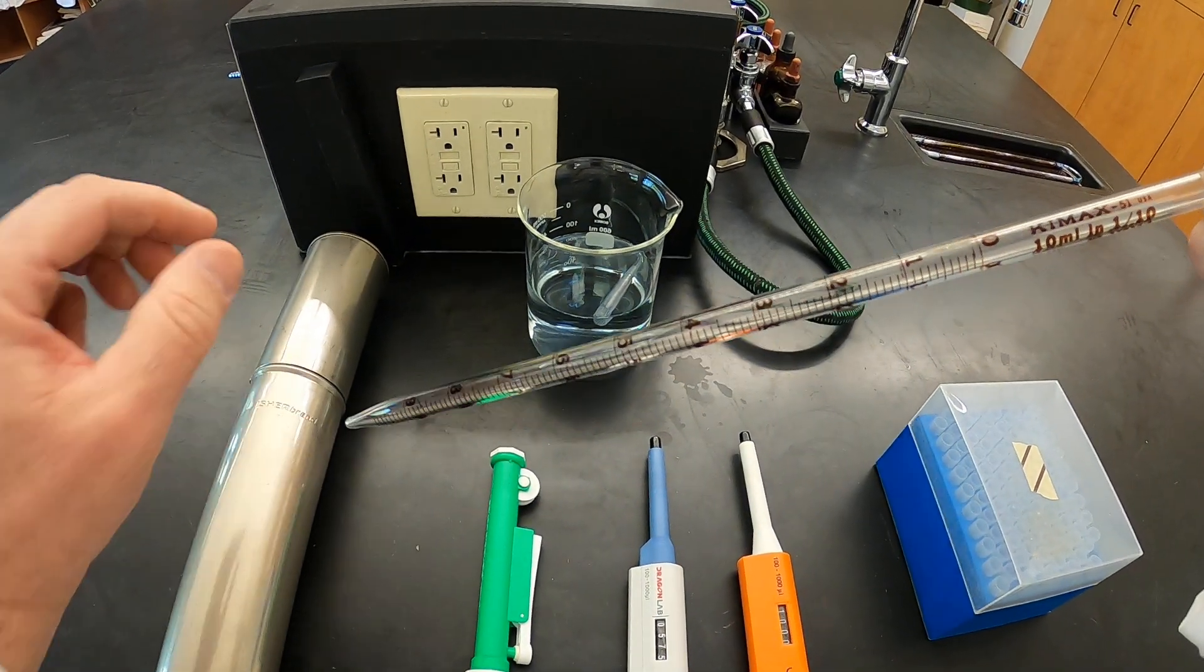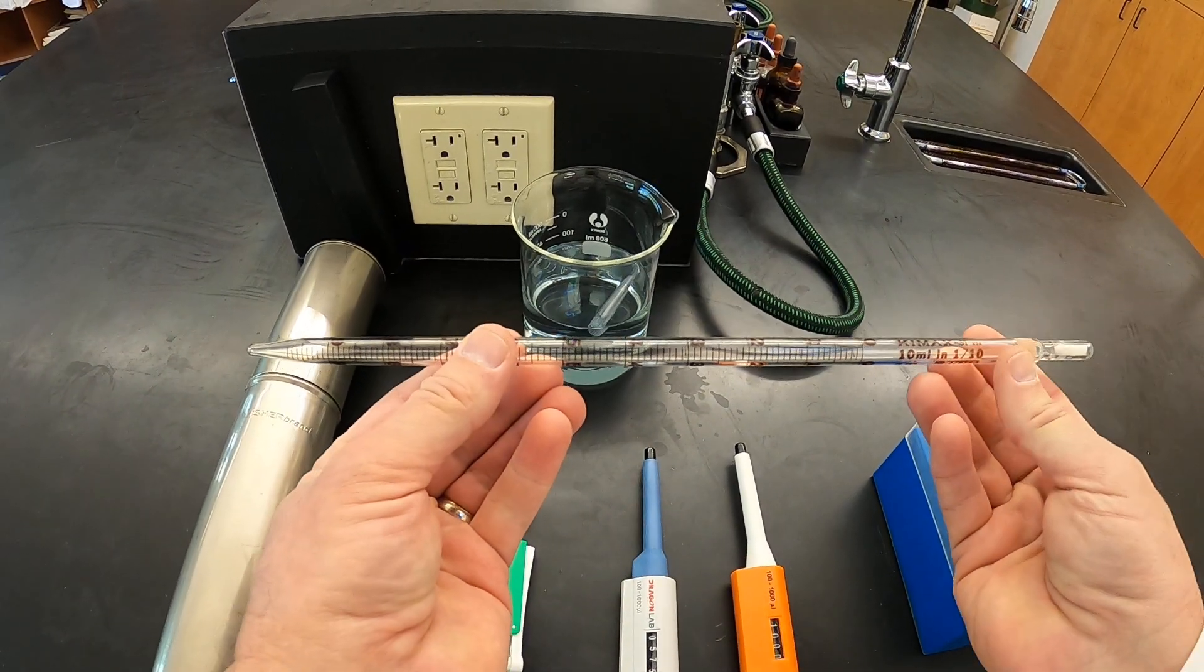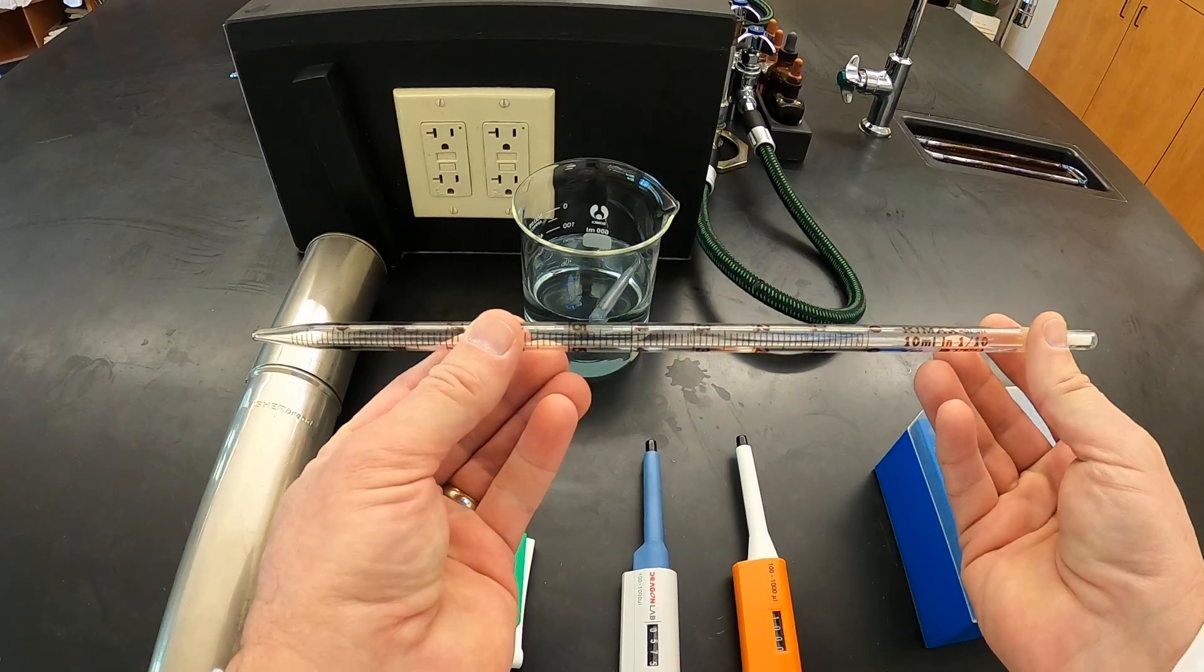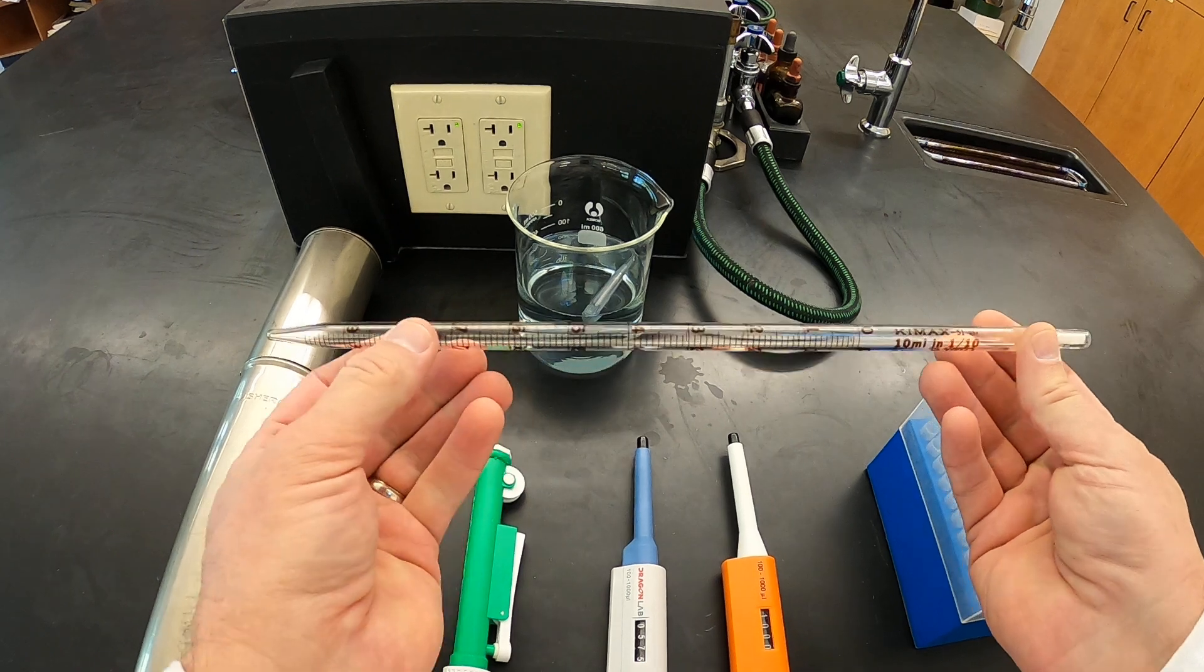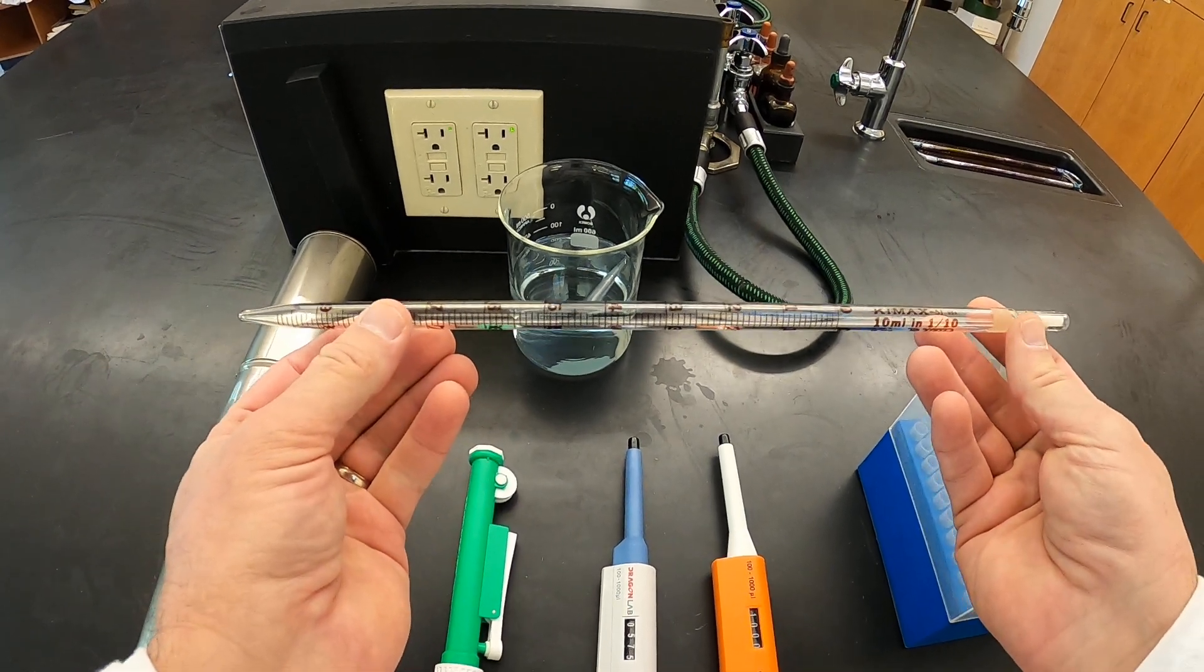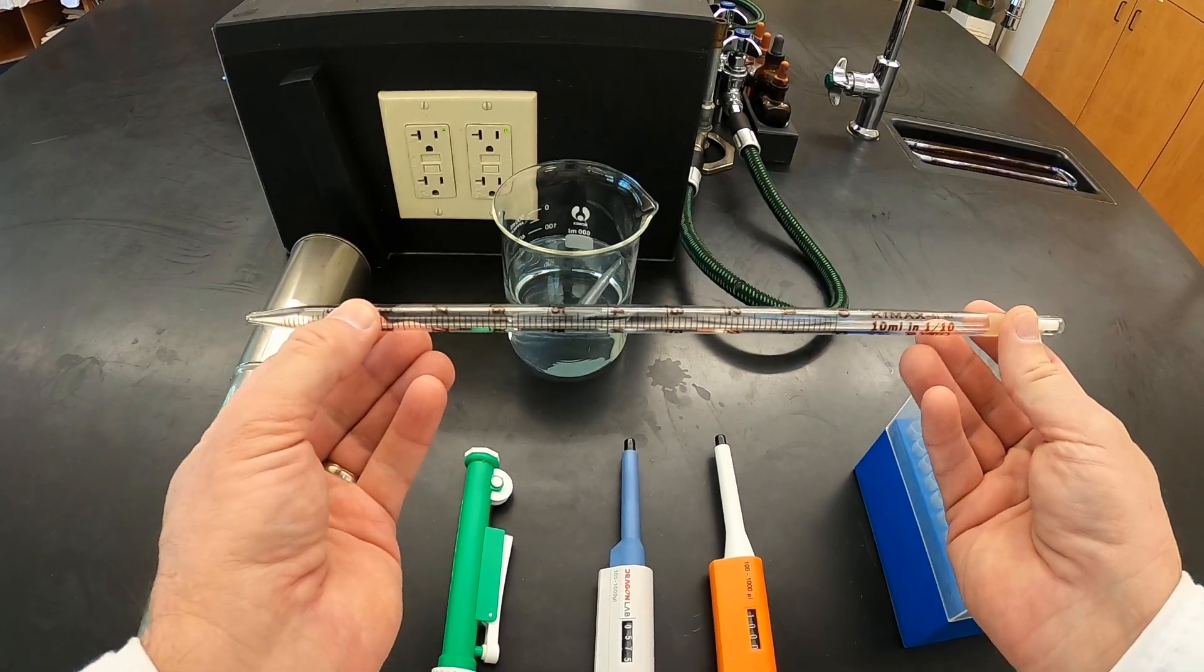And then I will show you what parts we have on this particular pipette. Normally if this was a sterile pipette I would not be touching anywhere near the end here, but because I'm just showing you the parts here and explaining how to do the measurements, we'll be able to handle it normally.